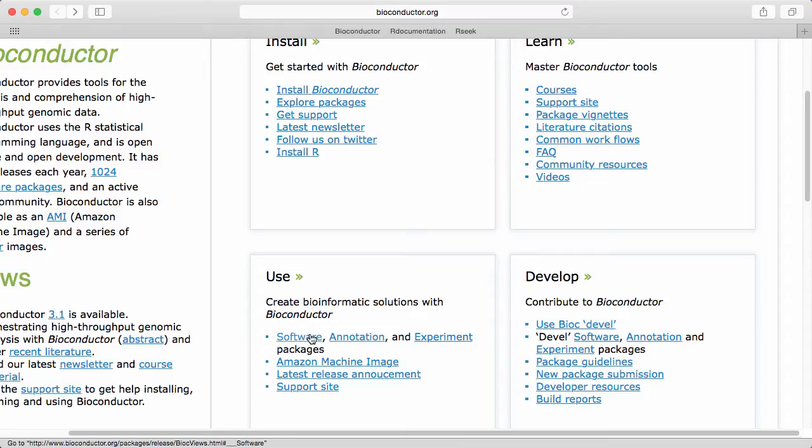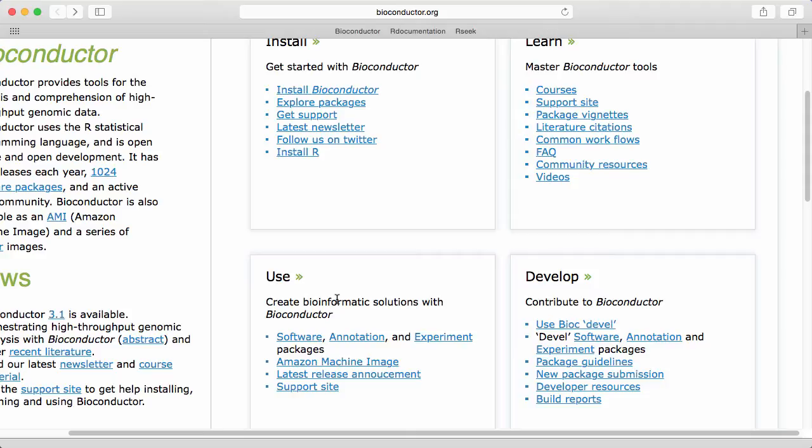We see that Bioconductor divides its packages into software packages which are the main workhorses, annotation packages which are prepackaged annotation information from various databases, and finally experiment packages which contains data from published papers which are used for tutorials, examples and sometimes to document an entire reproducible research workflow.